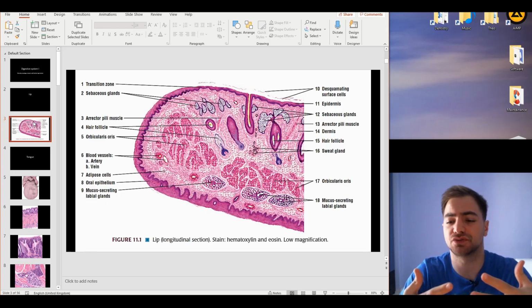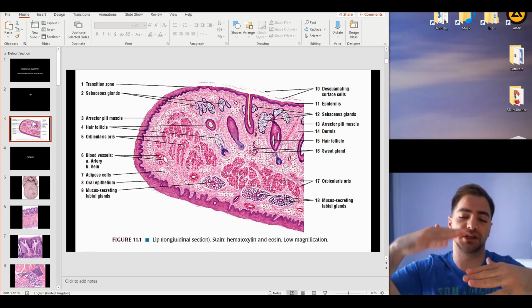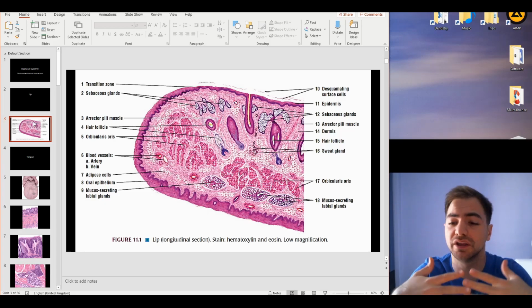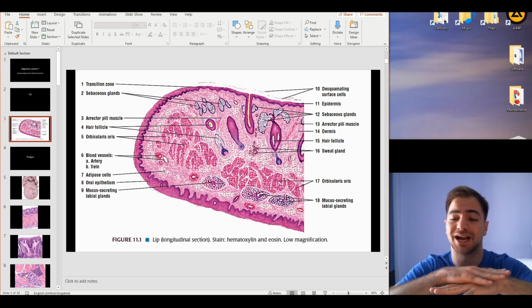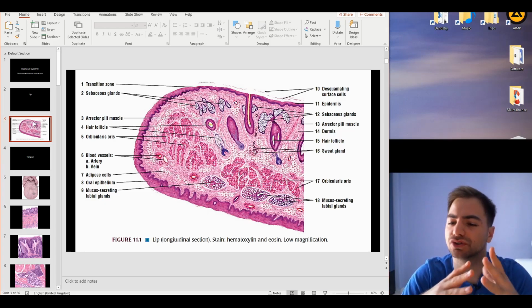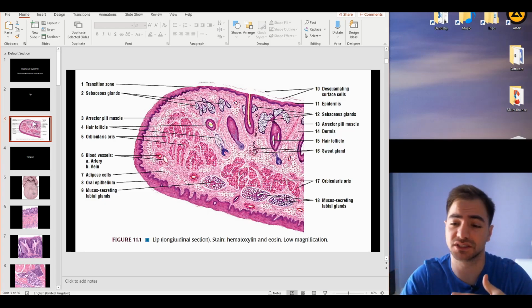Now the skin in this of course is going to have the stratified squamous keratinized epithelium, which is just again many layers of keratinocytes, dead keratinocytes in fact in the top, and you can actually see that there's anuclear structures in the top of the stratum corneum. Now of course the whole details of the epidermis of skin actually are going to be discussed in a different video.